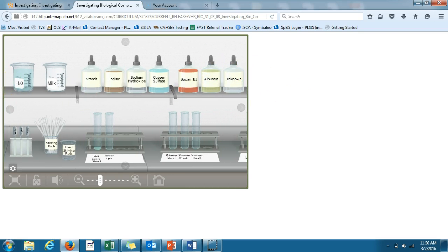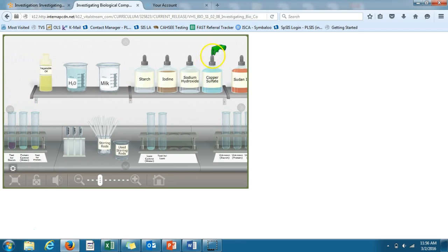And then remember, our chemical indicator for protein consists of 2 things, sodium hydroxide and copper sulfate. So I'm going to first put sodium hydroxide into both of them. Right? And don't forget copper sulfate. So remember, typically, if it doesn't have any protein, then it'll just be blue, which you see right here. Water doesn't have any protein, so it's just blue.